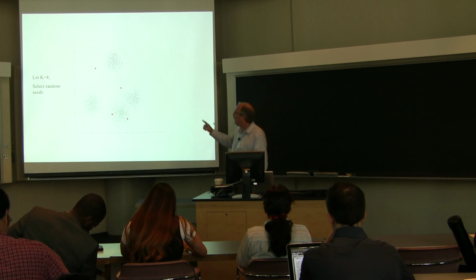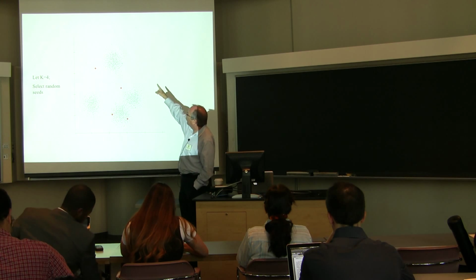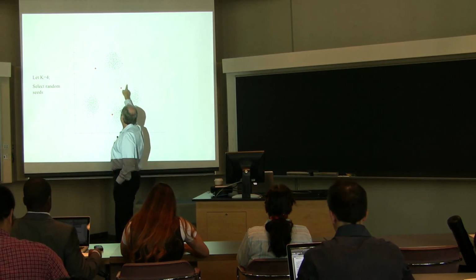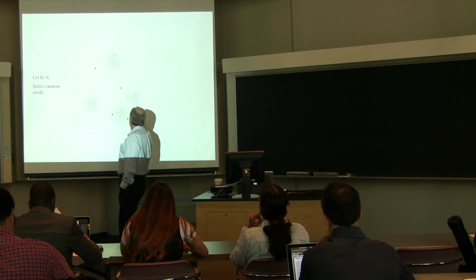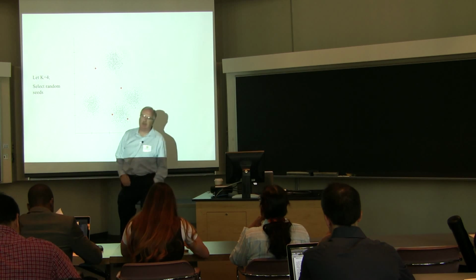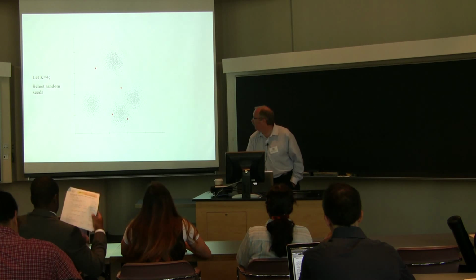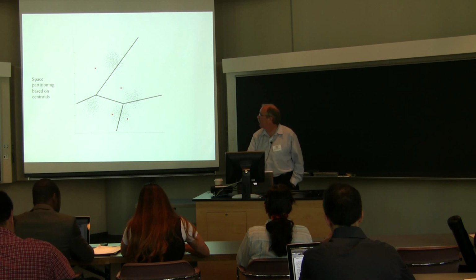And then what it does is essentially partition the space around those 4 events. So it will cluster these events: whatever events are closest to this particular seed, it will cluster those together, will then cluster these together, et cetera. Essentially you're partitioning the space between these different seed centroids. So it might look something like that.